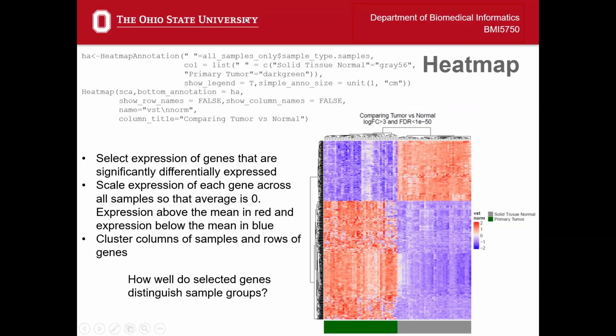So for one gene, we are going to scale that expression so that the average is centered around 0 and the standard deviation of this gene is set to a +2 to -2 level. So we are scaling expression.